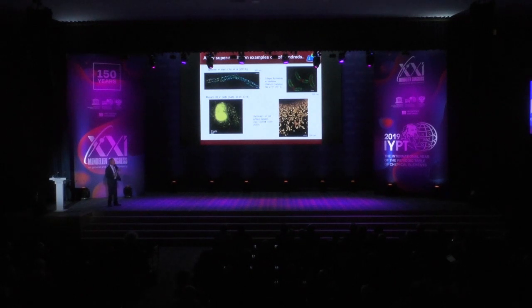The upper right is bacteria again, but we're looking at something called the S layer that forms on bacteria, doing pulse chase, where the old S layer is in green and the new is in red. With super-resolution, you can see a great deal of detail about how this layer is formed. And the lower right, glycocalyx. The glycocalyx is something that many people haven't heard about. But almost all of the cells in our body are covered with sugars, covered with different glycans in different patterns.